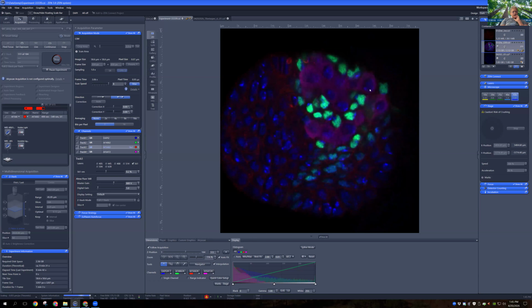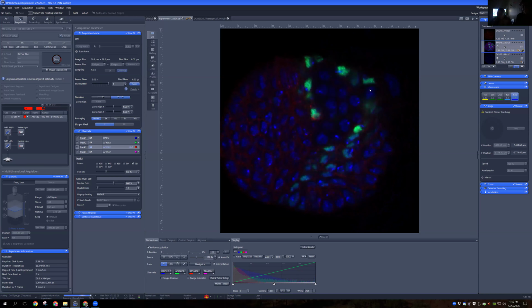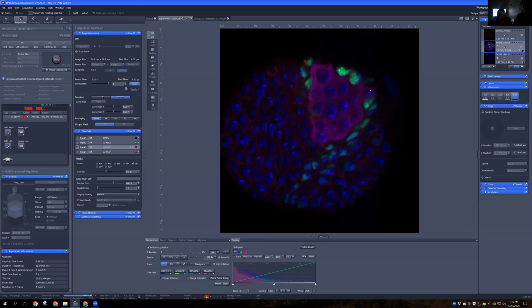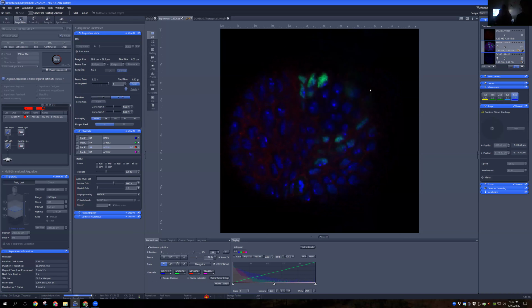What I should have asked is, is this effectively 3D imaging? In essence, yes. Because the Z resolution is so fine, I have very little loss of resolution in Z, which allows for a very good 3D reconstruction of the entire organ. And Z is distance into the sample, we are looking at XY here, right? Exactly. So what we're seeing here is XY, and the images are acquired pushing through Z.